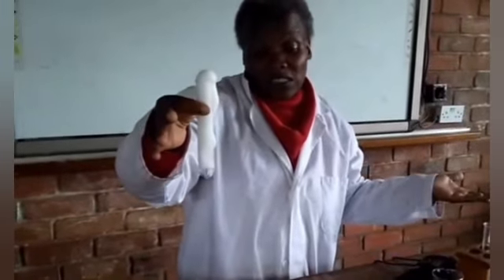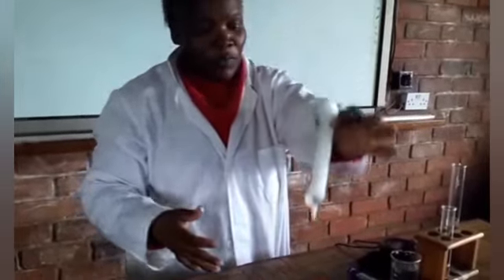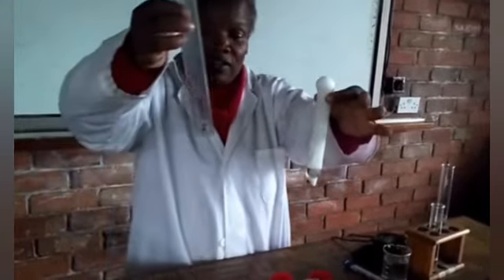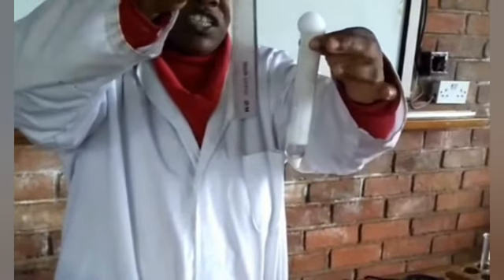Wow! Oh, can you see how explosive this region is? Oh, it's hot. It's also hot, guys. It's hardly 2 minutes. So I don't know how we are going to do this. But it's already spilling over. So at the end of the day, I simply have to measure the height of my boiling tube.